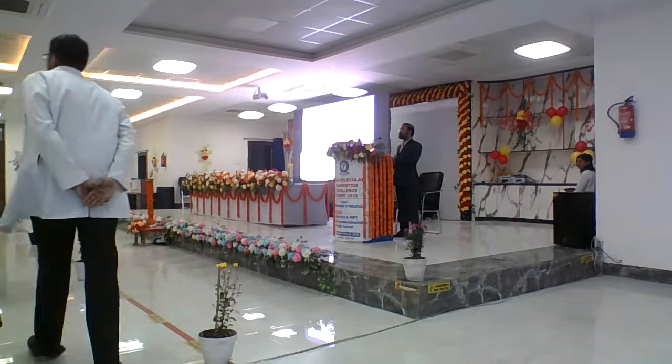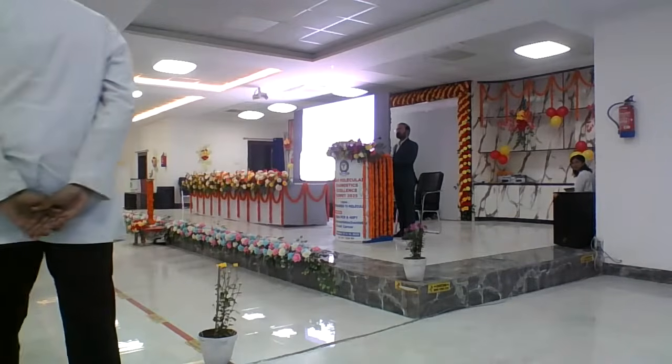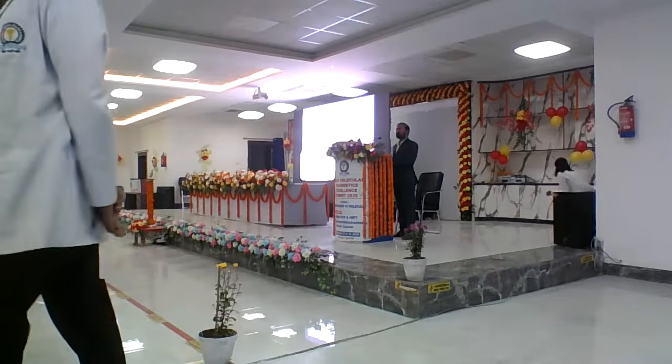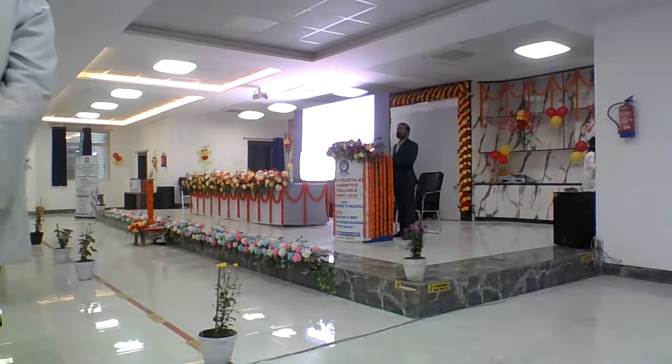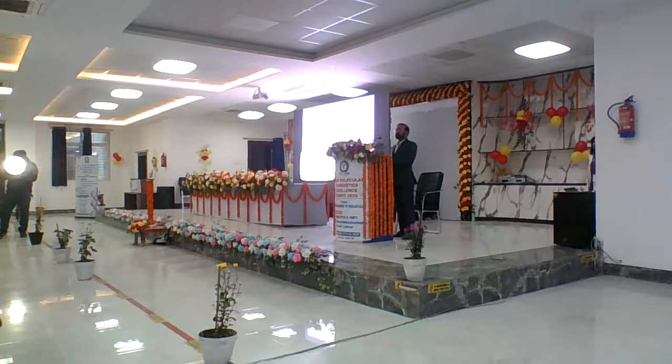Thank you, Dr. Anurag. In your experience, how would you place digital PCR over RT-PCR or conventional PCR, and how does it add clinical value to the diagnosis or to relapse detection? How should laboratories strategically plan with one of these PCRs?